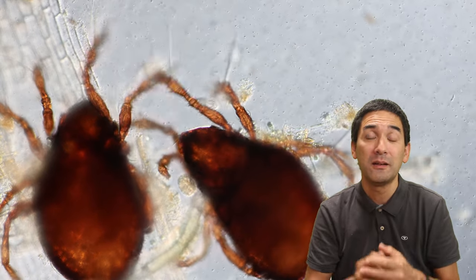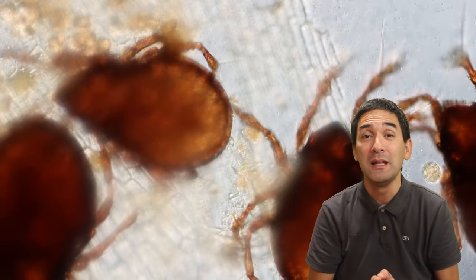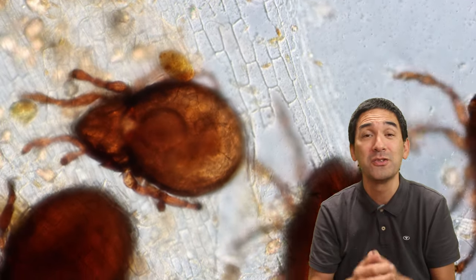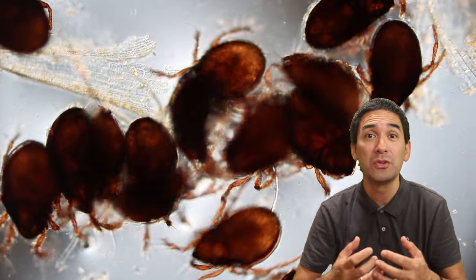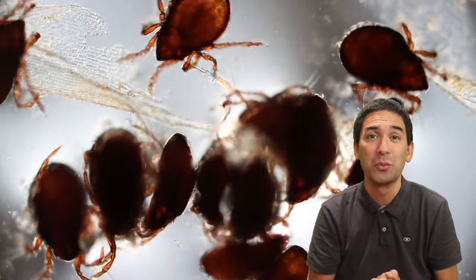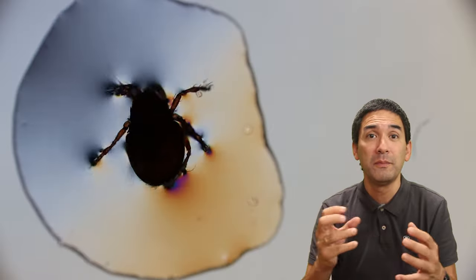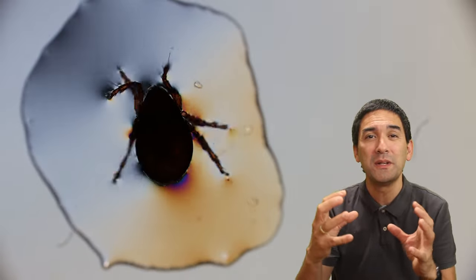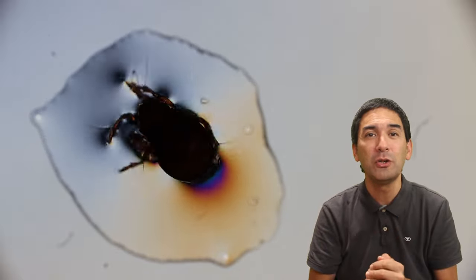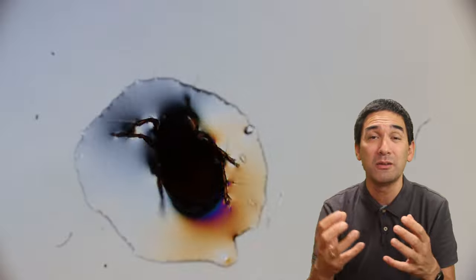When I made the slide with the mite, you have to make sure that you use the correct mounting medium and also that the mite is properly dry, because the mounting medium does not mix well with water. So it's important to dry the specimen a little bit, and then you add the mounting medium. Here you can also see that the body of the mite is relatively dark, and this is because the exoskeleton is absorbing a lot of light.